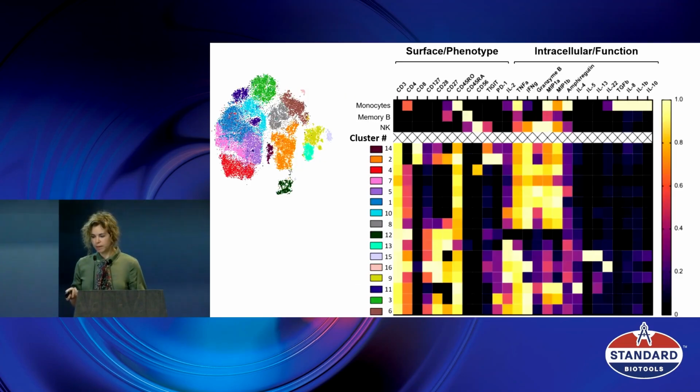And we clustered them. There's this map that everybody loves to look at and squint around, so yes, please go to the poster. But I just wanted to point to a couple of interesting things here. We can obviously detect Th1, Th2 lineages. We can detect some cytokines that are only produced by myeloid cells, so we don't really see them in T cell lineages, and they're not common to see in other phenotyping projects. So if we see some T cells suddenly expressing these cytokines, we're ready, okay?